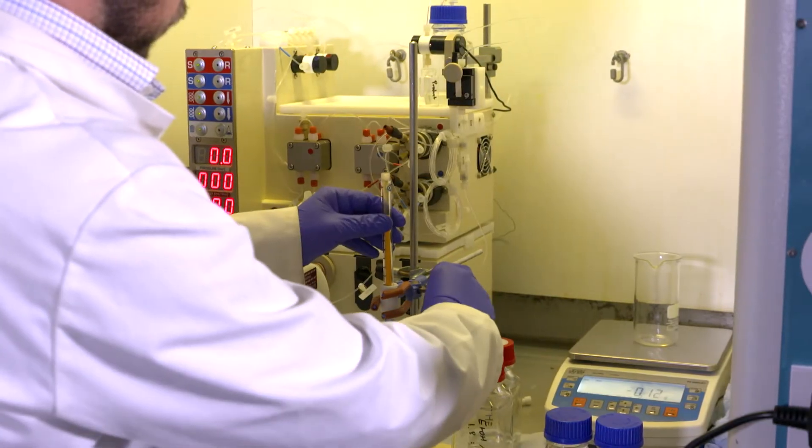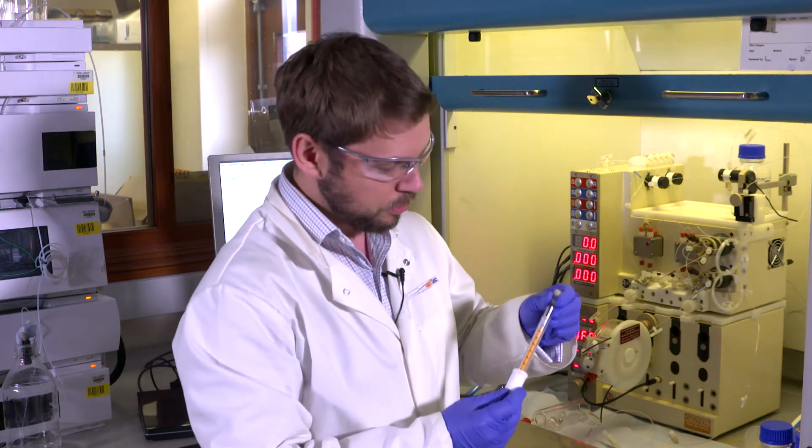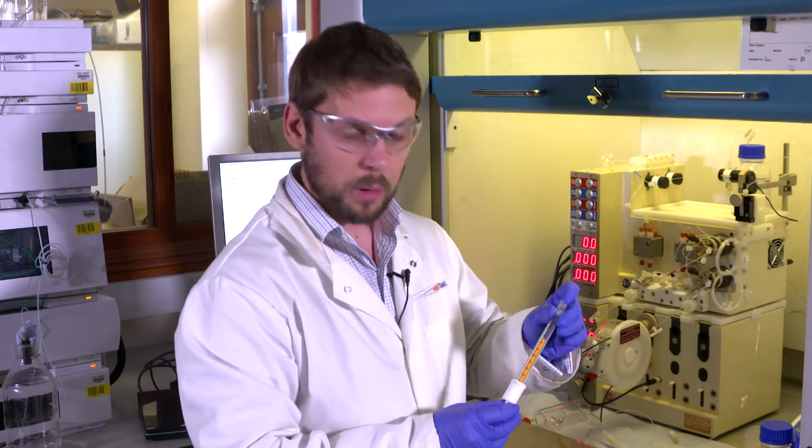Now I've added the catalyst to the column I need to weigh it again to find out how much I'm using. The next important thing is to determine what the dead volume inside the catalyst is. The easiest way to do this is to flow solvent through and then I can determine from the mass of solvent what the volume must be.